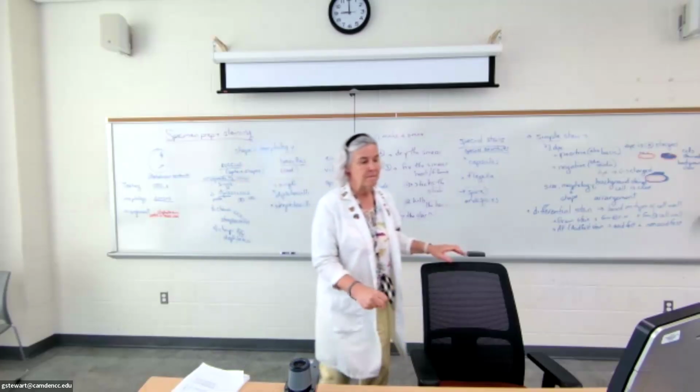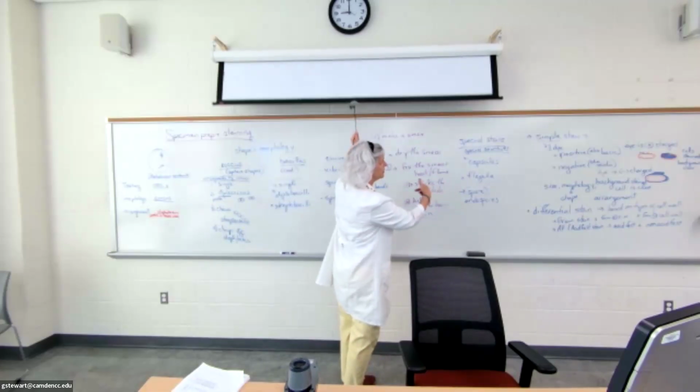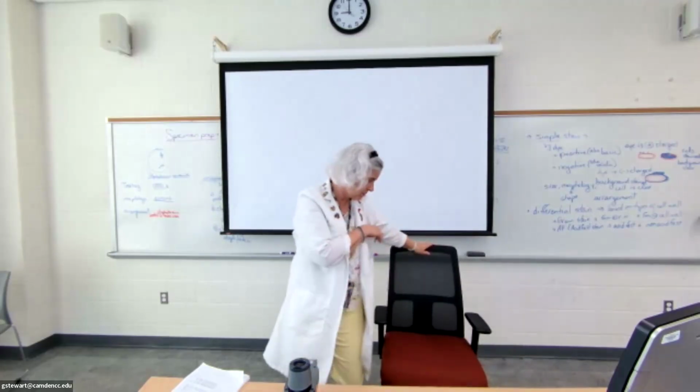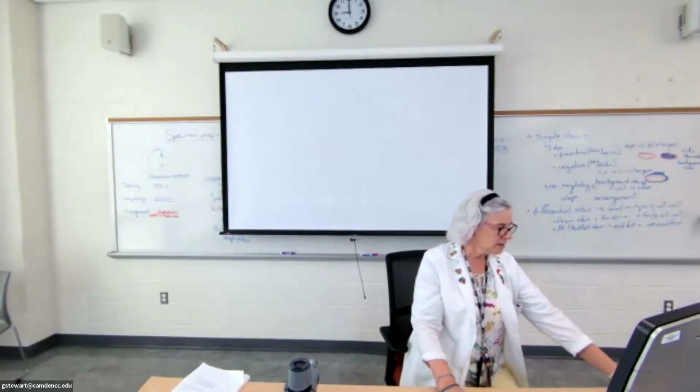Now, I would like to show you some pictures of the different stains, and then we're gonna call it a day for the lecture portion, and we're gonna go to lab. So let's take a look here.